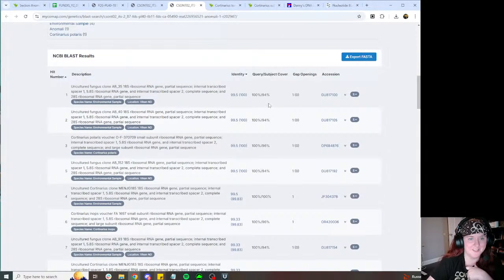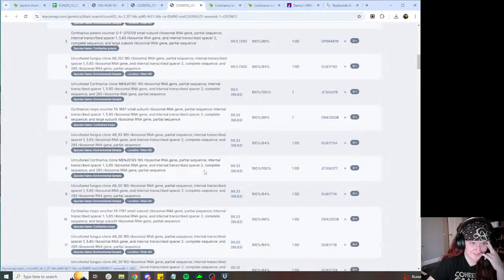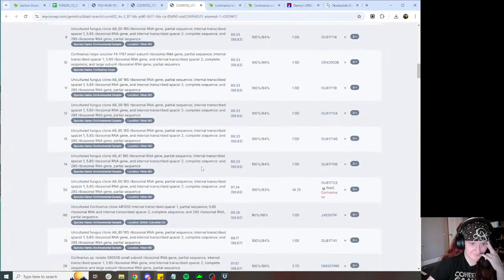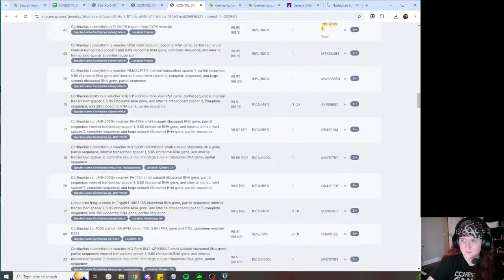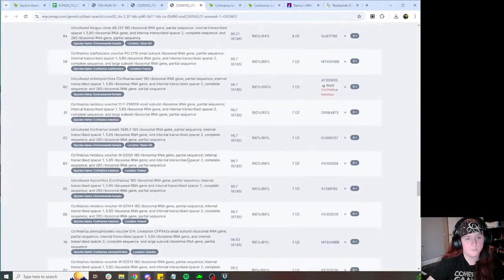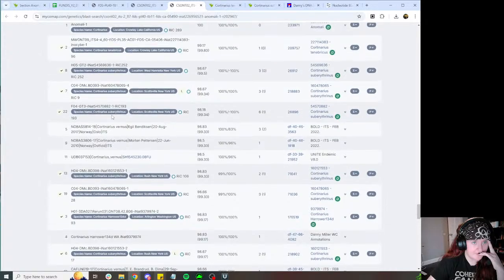Where's the type sequence? This is my problem. Someone will say, oh, there's a type sequence, but the type sequence isn't uploaded to GenBank, and then it's like, where am I looking? What am I looking for?